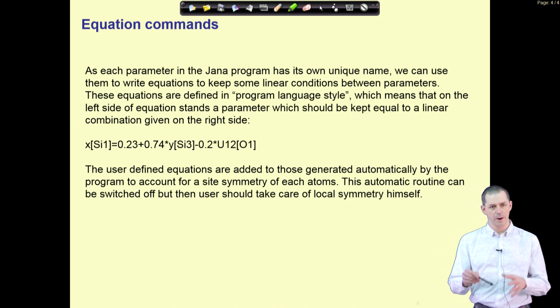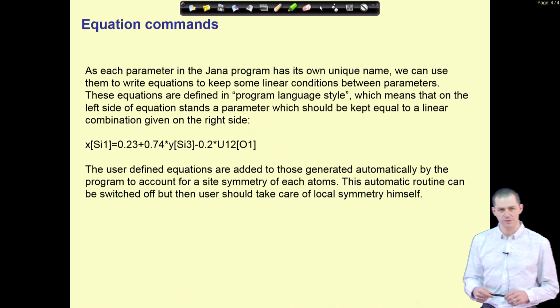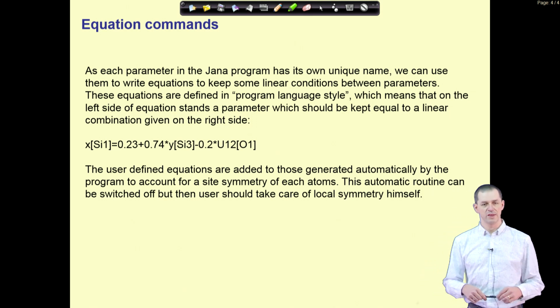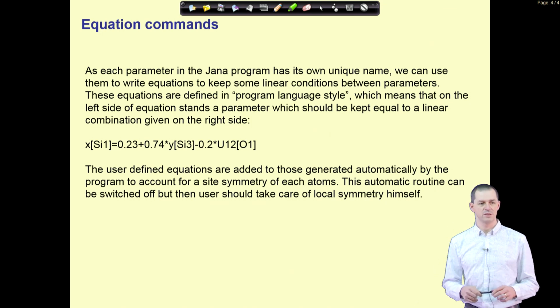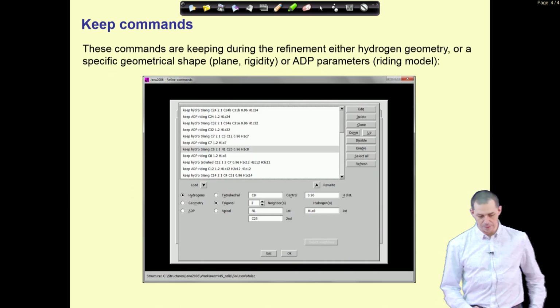You can really use any parameters you want, and again in one of the examples we will set up an equation that will ensure an overall charge balance in the whole structure. So you'll see how this is practically applied.